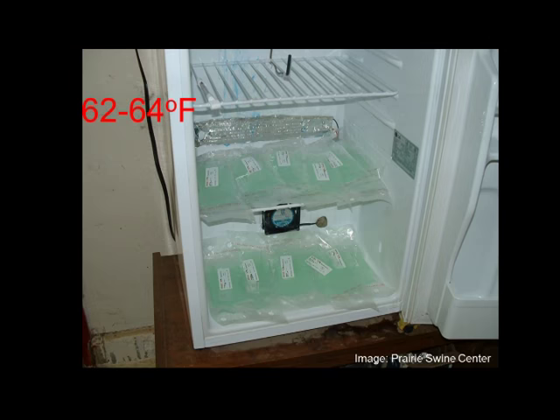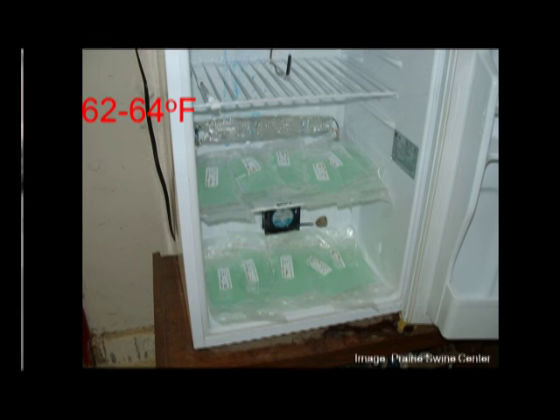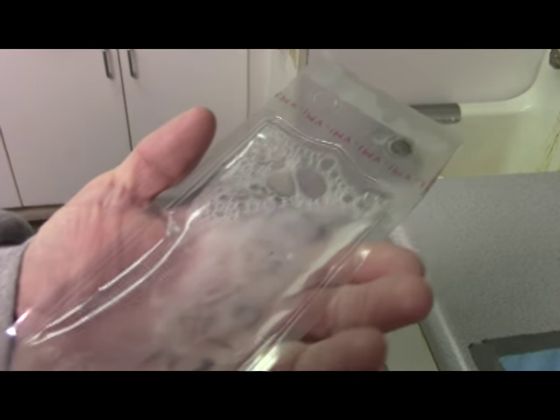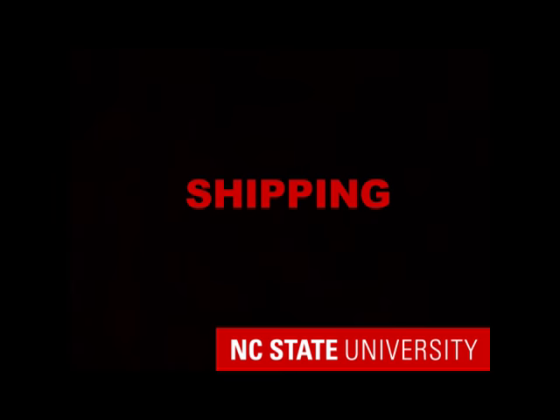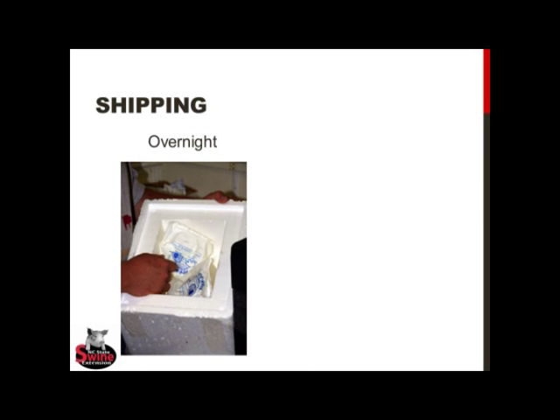We must store the semen bottles at 62 to 64 degrees Fahrenheit. Finally, twice a day for each day the semen is stored, we need to agitate the solution by slowly rotating the bottle to resuspend the sperm cells in the extender and prevent them from settling and clumping in a corner of the bottle. If the semen is to be sold for use on a different farm, it must be shipped overnight, and we need to take care that the temperature of the semen doesn't change during transport.